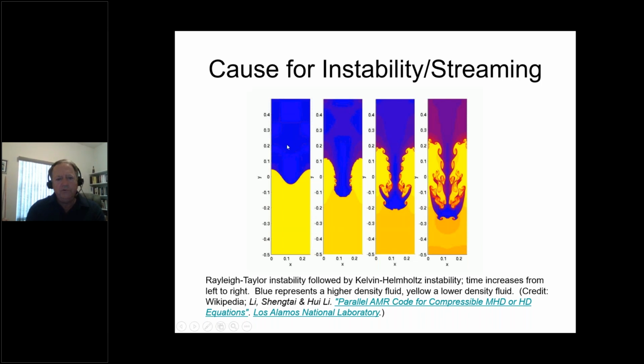If you try to put a more dense fluid on top of a less dense fluid, inevitably the more dense fluid will begin to penetrate the less dense fluid and displace it. And as it penetrates and displaces, it becomes ever more violently mixed in. And finally, you get what look like long streams of particles in the lower density medium. And this is exactly what people saw for many years when they tried to do differential sedimentation. It just didn't work very well. And many instruments were sold in the past that had strobe lights and that sort of thing, so that you could actually with your eyes see if the sedimentation was stable. By using an explicit density gradient, we don't need to worry about whether or not the sedimentation is stable because we are certain that it is.